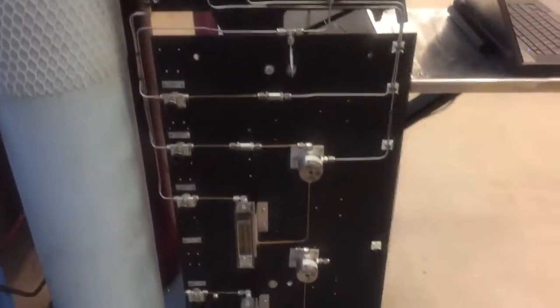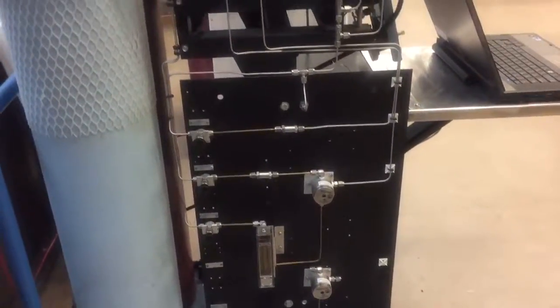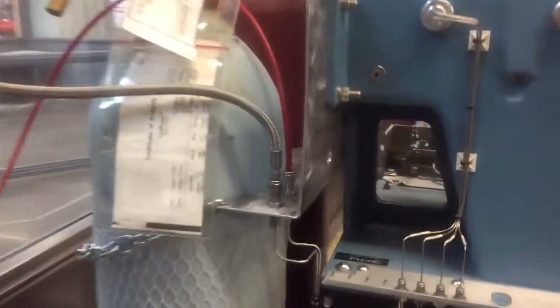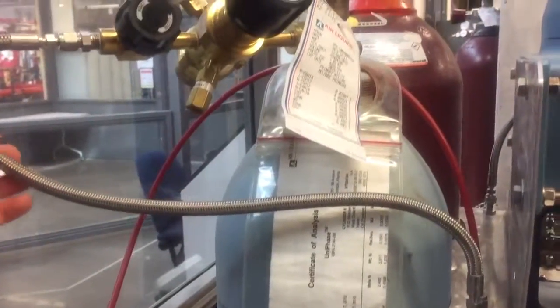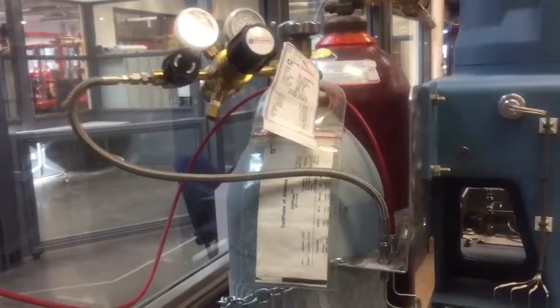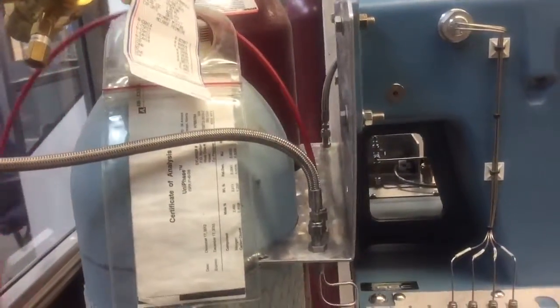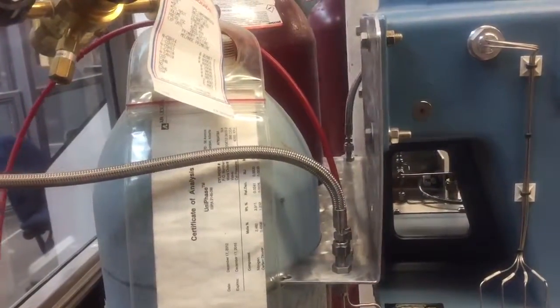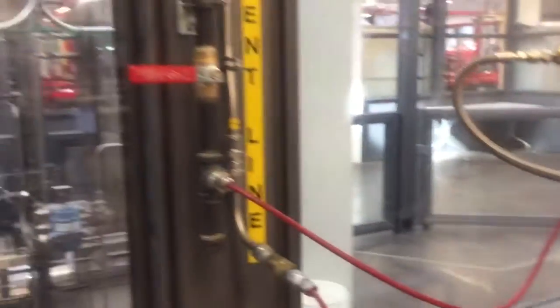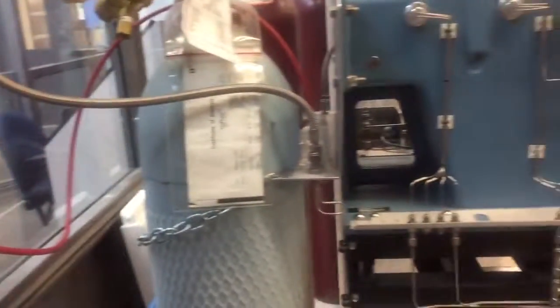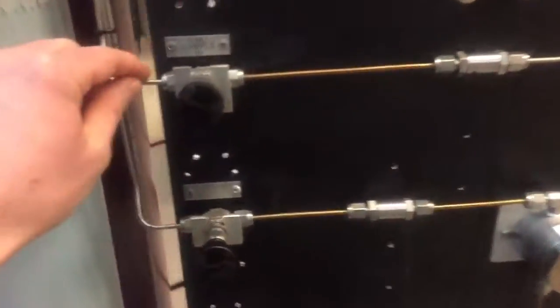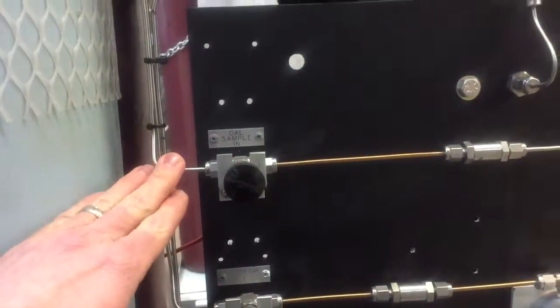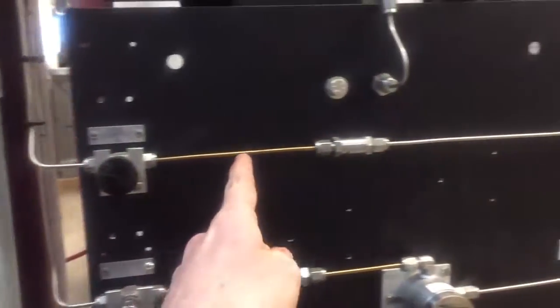If we look down here, this is our sample conditioning system. You'll see we have these two bulkhead quarter inch bulkhead unions right here. One has this steel braided stainless steel braided hose coming from the calibration gas cylinder, and the other has this red poly plastic tubing line coming from our natural gas line over here. They flow down into our sample conditioning system. This valve right here is where our calibration gas flows to. It flows through this check valve and then up into the analyzer.